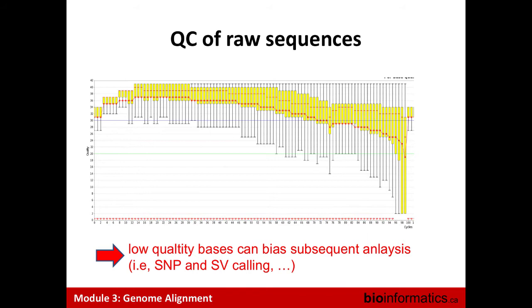The dot is always a big dot of the same color. But as the sequencing goes on, these delays can leave some sequences one base ahead and some one base behind the majority of the sequences in the cluster, and that will create other colors that pop up in the middle of the cluster and decrease the quality of the dot read by the sequencer. That's why the quality decreases.